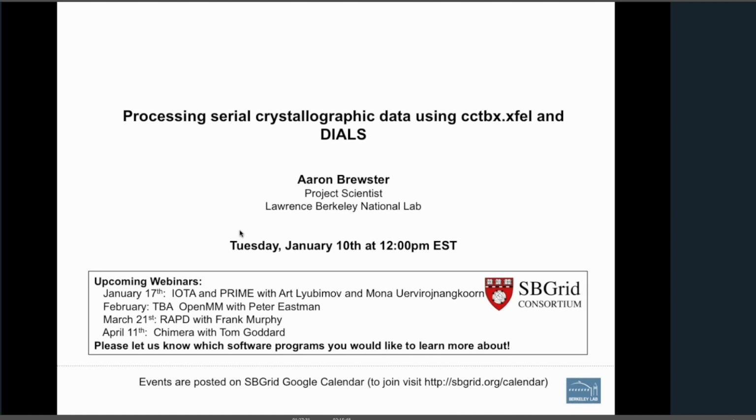Okay, yes, thank you. And then what we've been able to do then is this what's called ensemble refinement. An ensemble refinement means take one detector model and then 1,000 crystal models and refine everything all together in one big joint refinement job. And that requires a new and interesting way of handling a huge minimization problem. And then if you do that, this is new results that we just got last week.